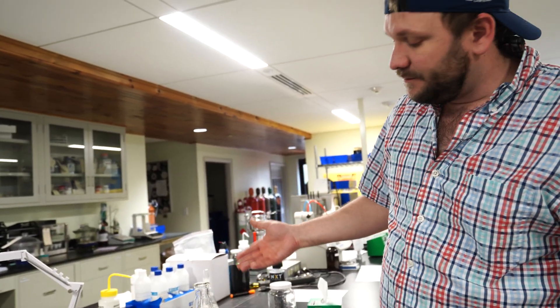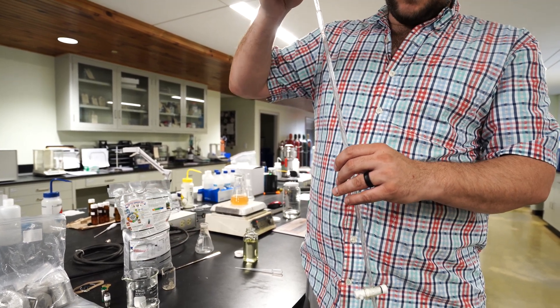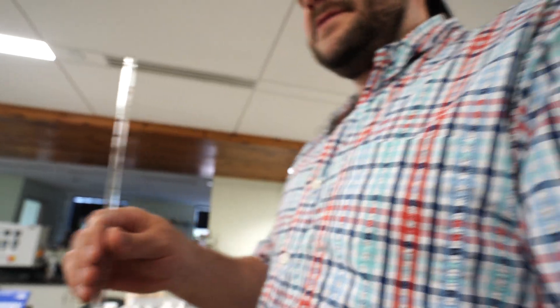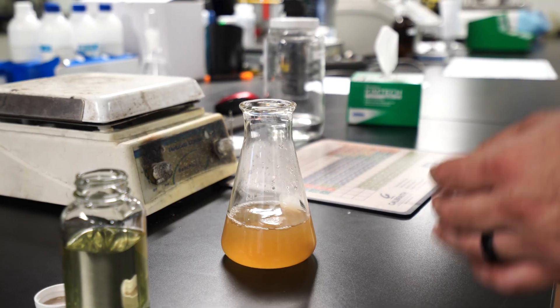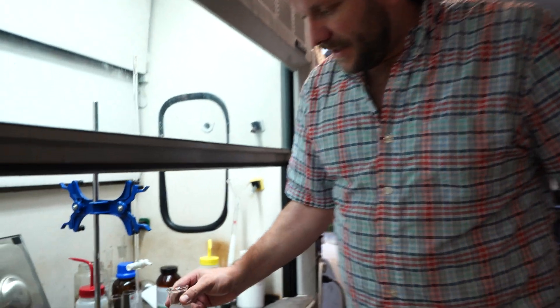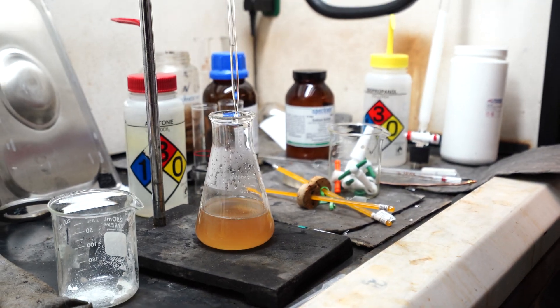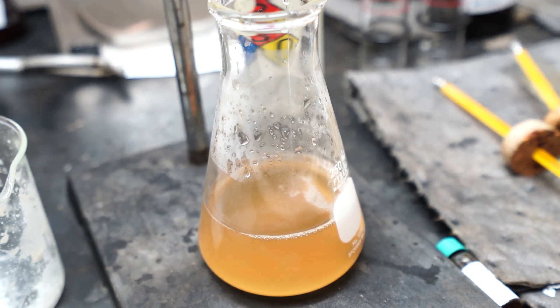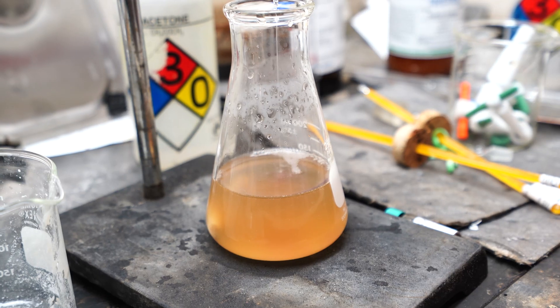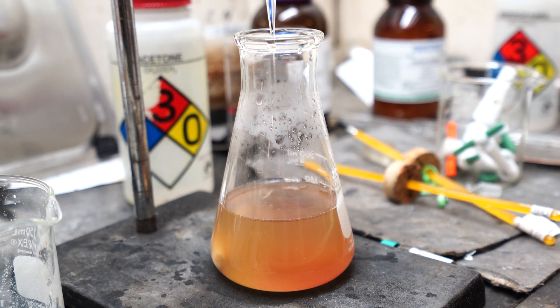Now we're going to backward titrate this to estimate the calcium carbonate equivalent of this product - meaning how effective is this compared to traditional standard lime. We're going to put 10 milliliters of our sodium hydroxide solution in here. Now 22 milliliters is about what it took for standard lime, so we will see how close that is with this material. We'll add our five drops of indicator. Because I've done this before, I know this should burn through 10 milliliters no problem, so I'll add these first 10 milliliters pretty quickly.